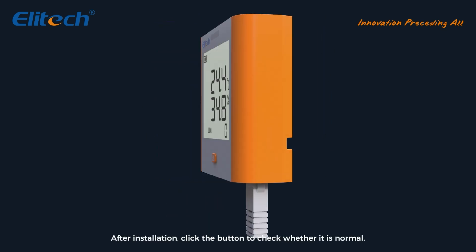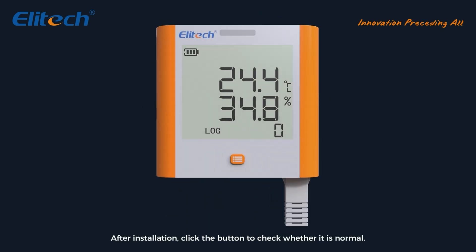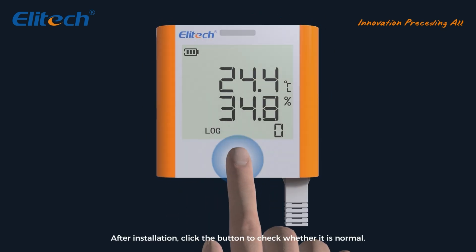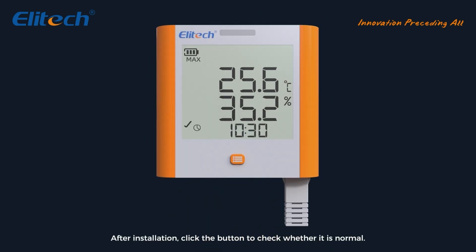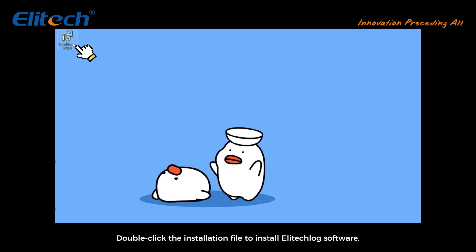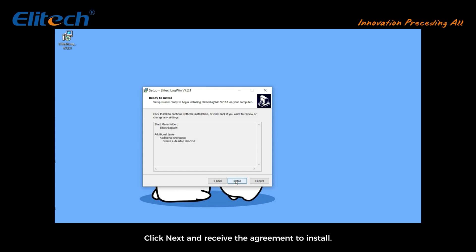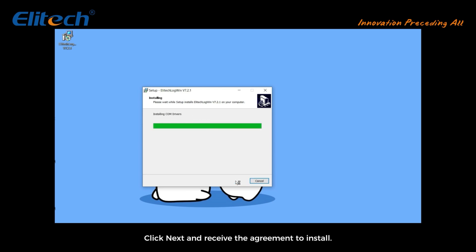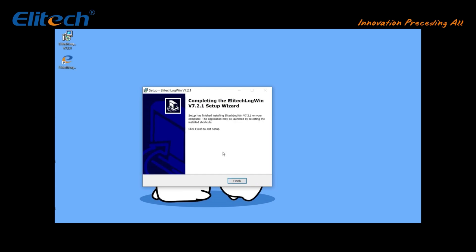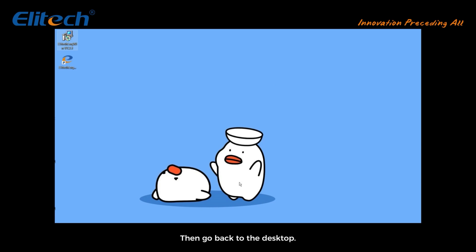Close the lid after installation. Click the button to check whether it is normal. Double-click the installation file to install Elitech Log software. Click next and accept the agreement to install. Then go back to the desktop and double-click to open Elitech Log.